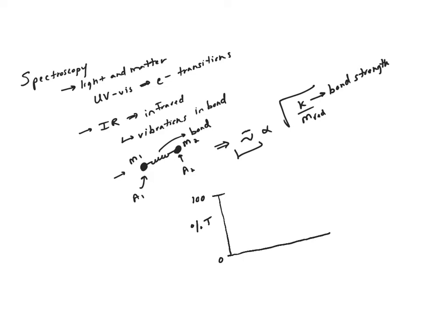And so instead of looking at peaks in the spectrum, when we see absorbance, we're looking at, instead, troughs. So this would be what we would call a peak, even though it's kind of the inverse of a peak, right? Anytime we see something like this, we know our light is being absorbed at whatever wave number we're looking at, okay? Now that I mentioned that, what was on the x-axis here?